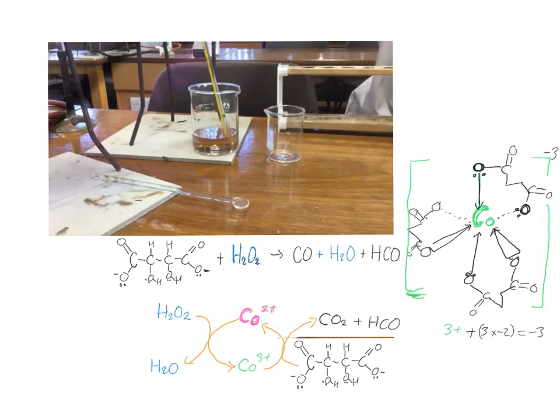Now you can see again the transition metal is changing its oxidation state. The cobalt is becoming oxidized, and the oxygen in the hydrogen peroxide is becoming reduced because it's gone from a -1 oxidation state to -2. And at the same time, the cobalt becomes oxidized to cobalt 3+.